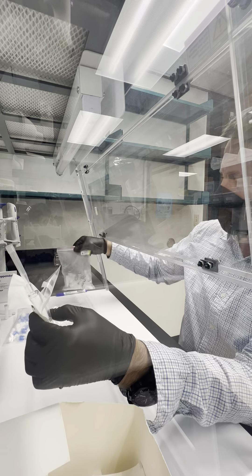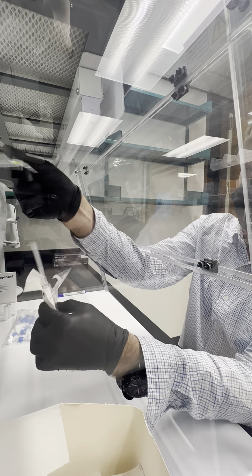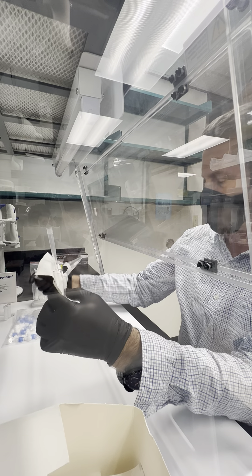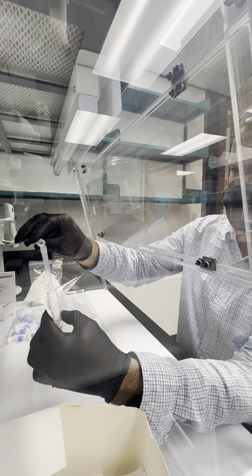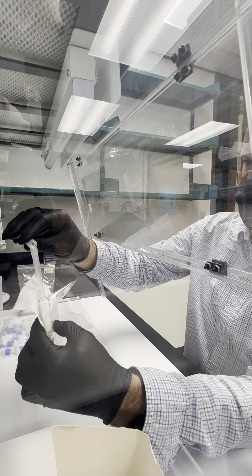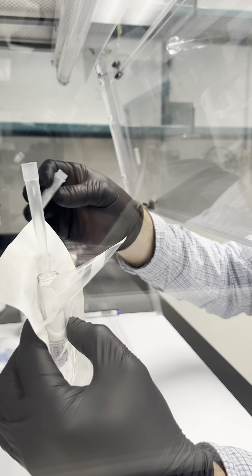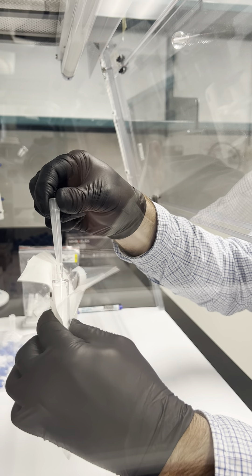We then get the Zymo ZR bashing beads and those should just pour nicely into our pipette tip funnel. It goes right in — it's easy. We can then remove the funnel.